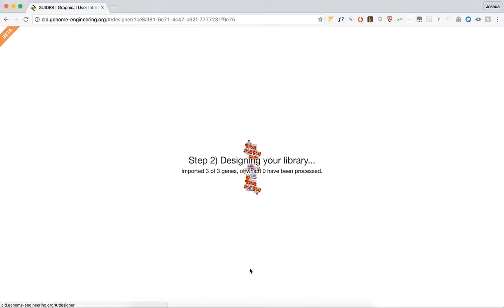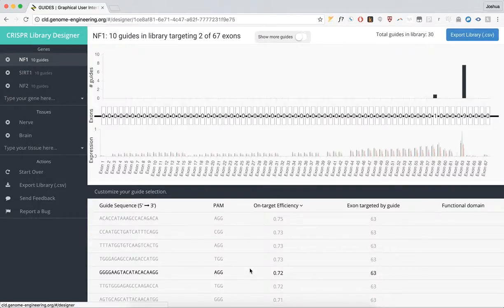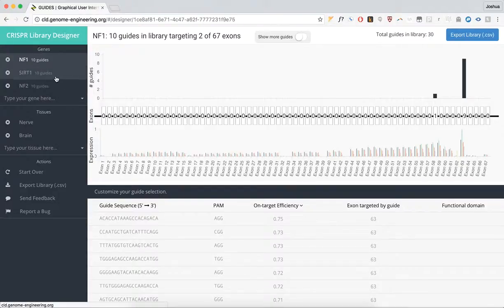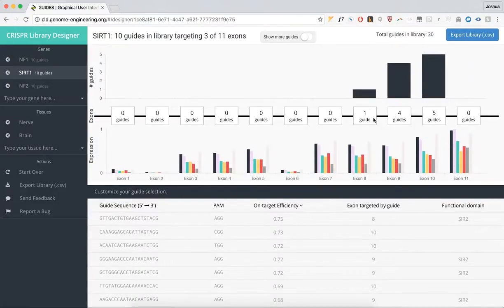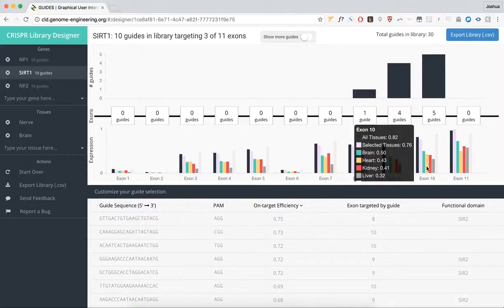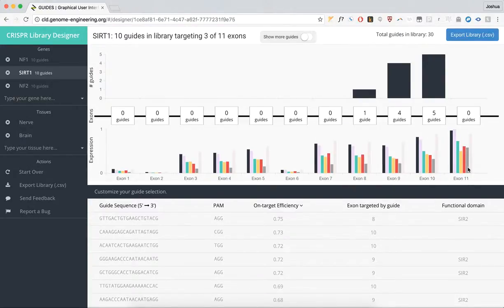Your library will be designed, and when it's done, you can fine-tune your experiments over here. You can see how many guides are targeted for each gene, along with the expression data, which is normalized to the highest expression across all exons.